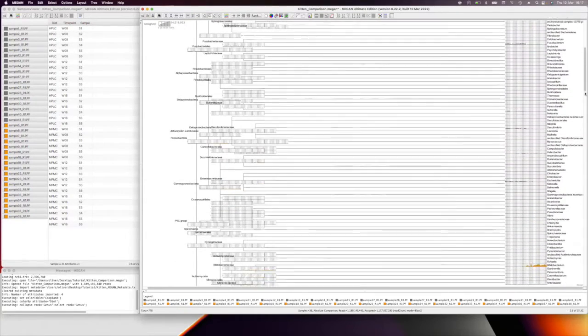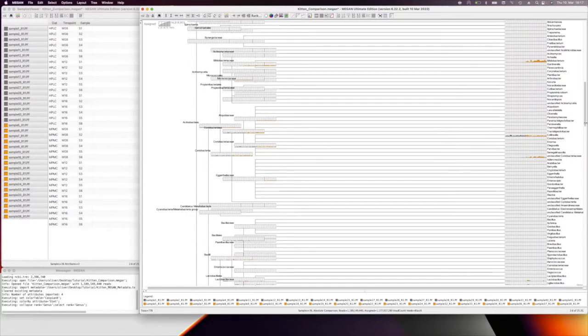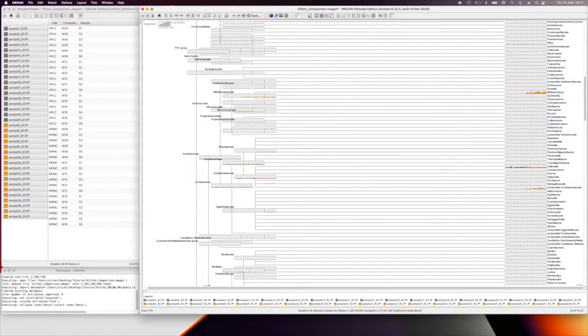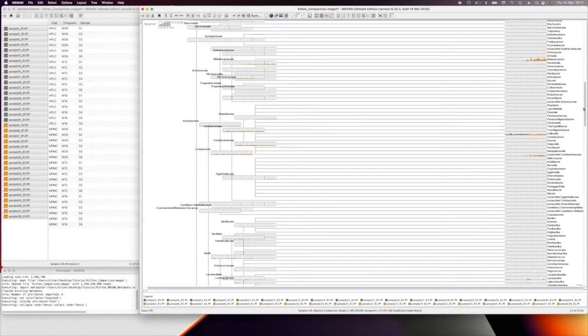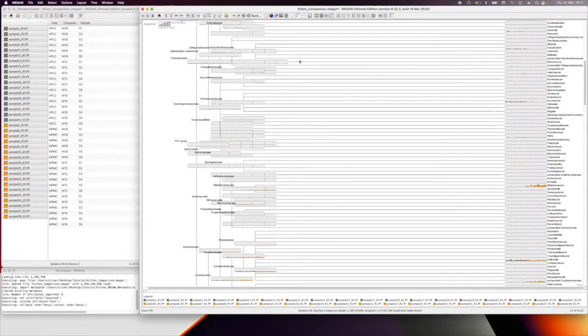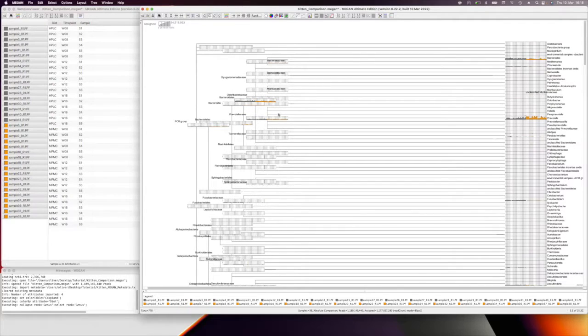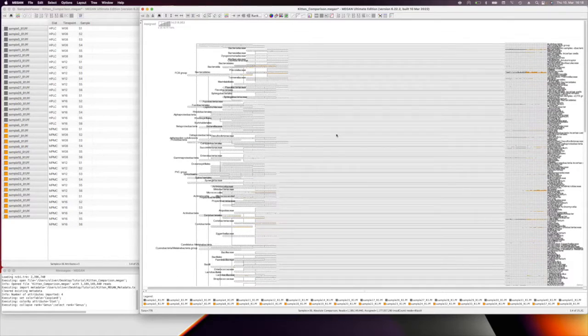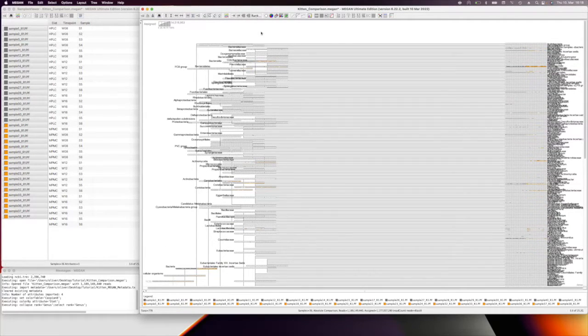And what I like to do with this study, because I'm quite familiar with it, is have a look at Bifidobacterium, because I know it only ever occurs in this group on the right, and not in the other one. So just to make sure that during the import process, everything has worked. So it's worked, I'm happy with this. And what we can do now is collapse or uncollapse this tree and compare the abundances of our taxa at different phylogenetic taxonomic ranks.